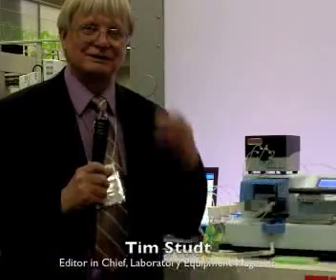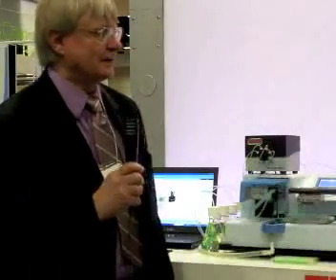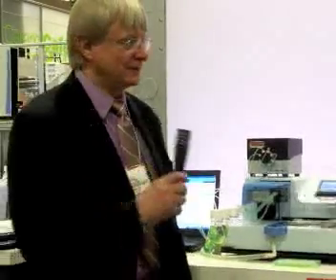Hi, I'm Tim Studd. I'm the Editor-in-Chief of Laboratory Equipment Magazine, and we're here at SLAS in San Diego. We're here talking to Thermo, and Jeanette Minshaw is going to tell us about some new products that they're introducing at the show. Jeanette?